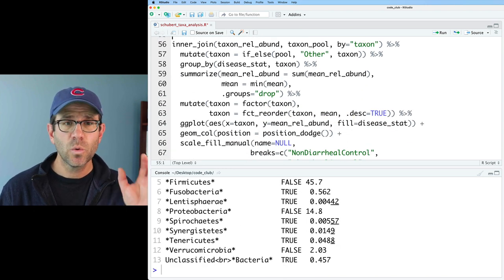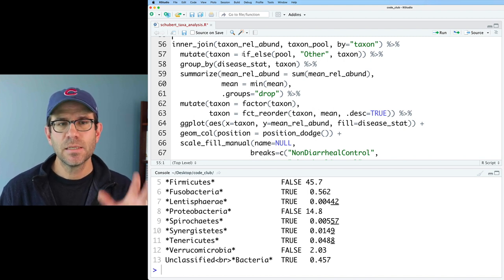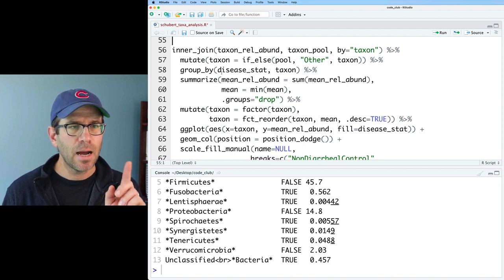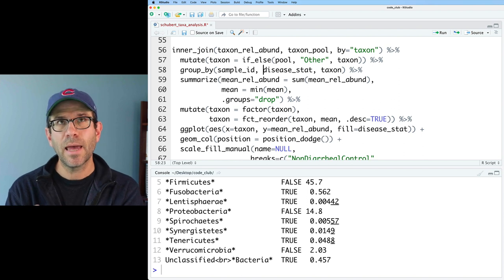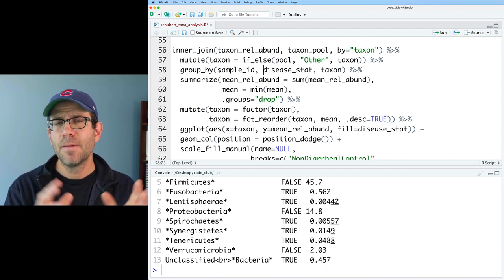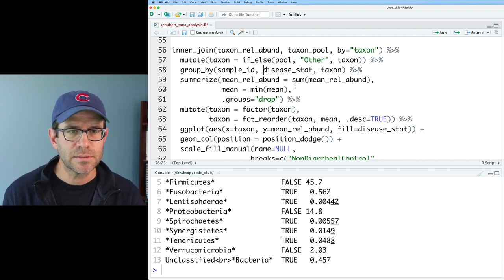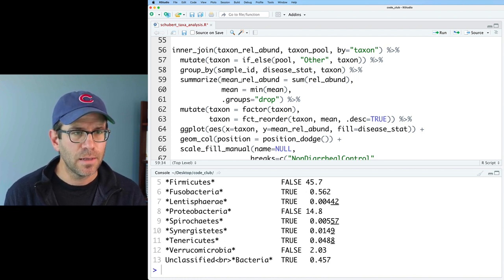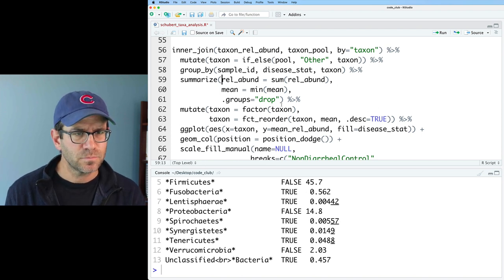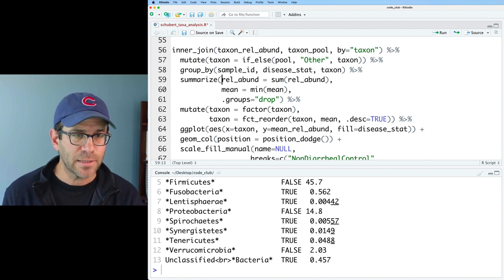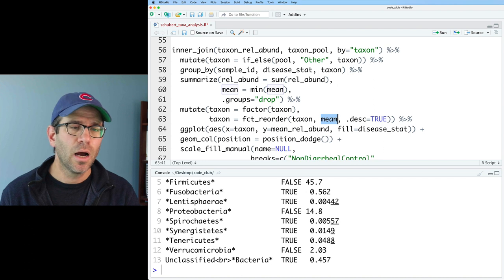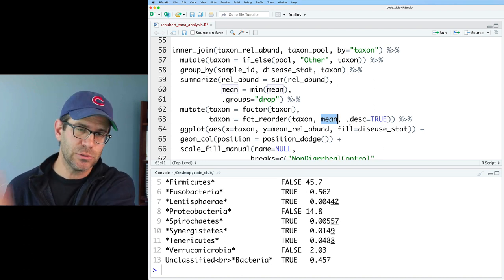Next, we're going to go ahead and bring this into our inner join with taxon-RELA-BUND. We then mutate taxon so that if pool is true, so if we should pool it, then we're going to call it other. Otherwise, we're going to use the taxon name. We'll then group by disease stat and taxon. Actually, we also want to add in here sample ID because we want to join together those taxa-relative abundances for each person separately. We're also leaving the disease stat in here because then when we finish the summary, we'll still have the disease status for each of the subjects. And so here then we're going to do sum on relabund and I will also call this relabund. And then the mean, it will be the smallest value of the mean. Again, this is used for sorting our different phyla. And then we've got all this good stuff for ordering our factor of the taxon, ordering our taxa using factor with FCT reorder, using that mean column to determine the order of the data. And we're going to do a descending sort from most abundant to least abundant. Good.